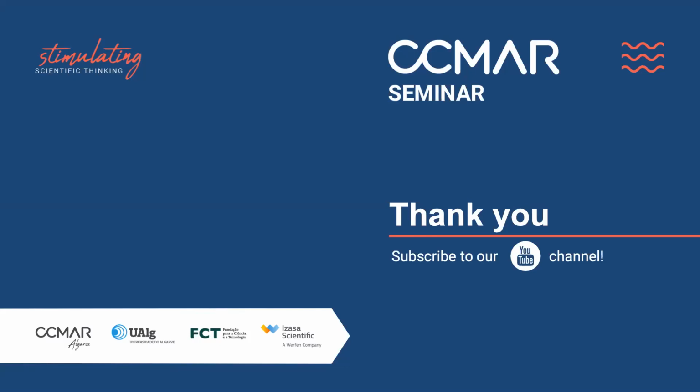Thanks. Yeah, the removal of mainly other particles from natural samples is really a nightmare. It's not really the presence of other compounds that might bind to the microplastic, because if you are using the infrared microscope, you can get a spectrum of your particle, and you can search for a combination of spectra from the libraries that give rise to the experimental one.